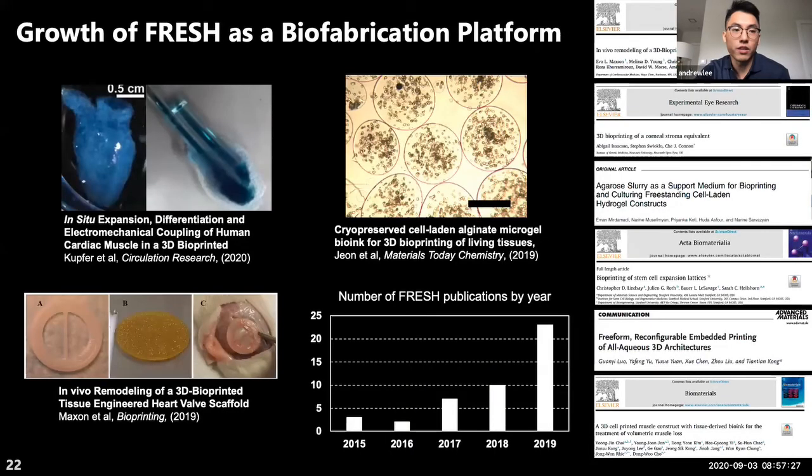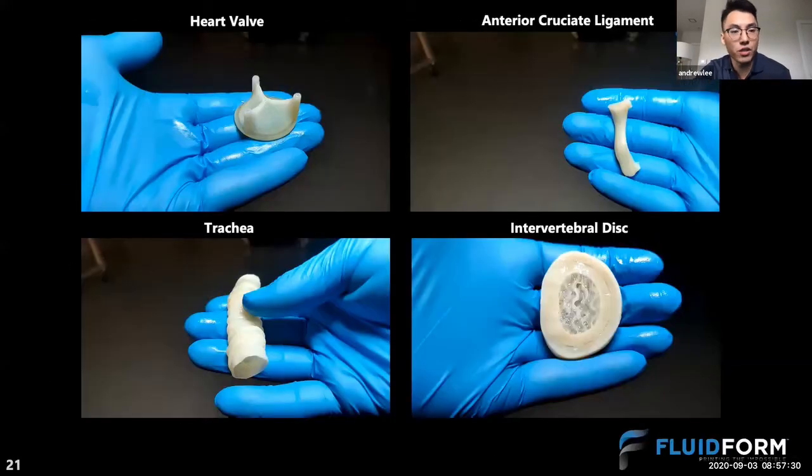Yeah, so for example, these prints were printed out of collagen type 1. Collagen is typically an acidic solution that will gel when neutralized, and also further cross-links or gels when it reaches body temperature. So what happens is that you take this acidic solution and print it into the support material. Inside the support material, you have a buffer that very quickly neutralizes the collagen solution. And so as you're printing, you're beginning to solidify these gel or collagen filaments that we then stack layer by layer to create the three-dimensional structure.